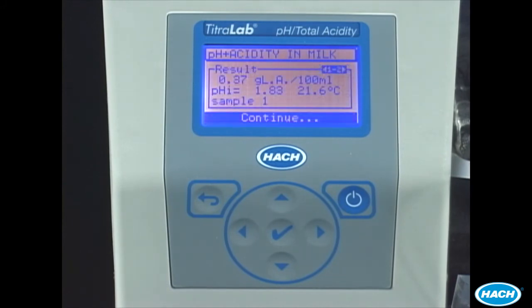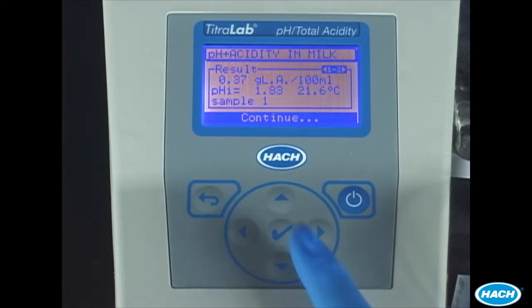The final result is displayed when the titration is complete. In this case, we got 0.37 grams lactic acid per 100 milliliters with a pH of 1.83. Press OK to confirm the result.